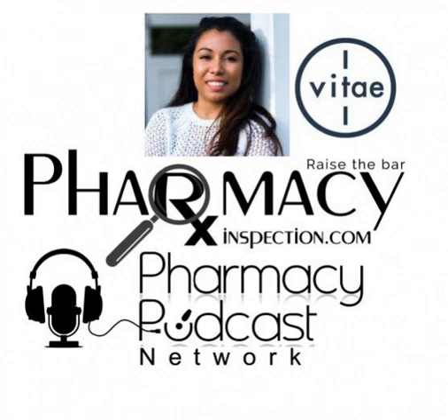Interesting. So looking at the long-term cost, I'm just wondering if maybe we've done some efficiency studies, some workflow studies, now that we're going to directly involve a process machine. Again, I've still got the manual labor up front, which I would have anyways, whereas the technician is weighing on an analytical balance, then they're mixing, possibly triturating. So tell me, how are we looking at this from a personnel labor perspective long-term, especially as we're building large batches? Great point, Bryan.